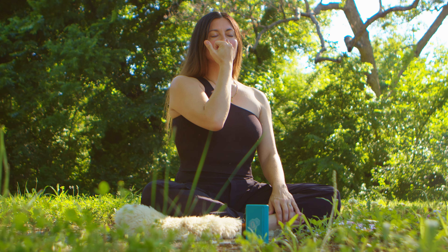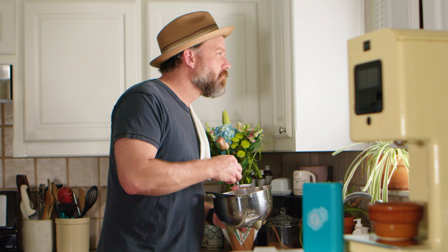Within two minutes, your results will appear. And that's it. Now you know the dominant active compound and potency of your infusion. What's next is up to you.